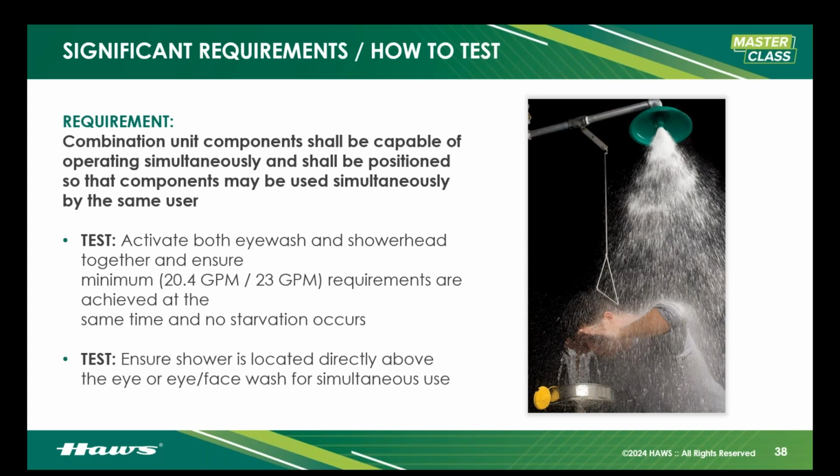Very sneaky, not frequently found until you get some sort of site survey in place and they're really digging in and making sure they're activating them simultaneously. Make sure you're doing that on site if you're doing your combos and testing them. It also has to be positioned so that both components are lined up. The shower head has to be directly over the eye face wash or eye wash. Well, not directly over, but just in front of it, but aligned so that a user standing in front of the eye wash or eye face wash is underneath the shower.